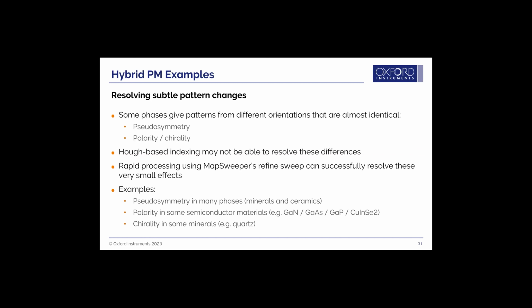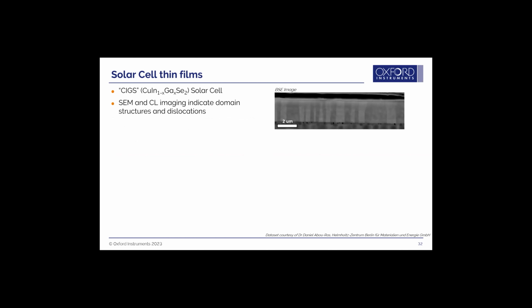And again, we're trying to solve this pretty quickly. We're trying to resolve the pseudosymmetry rather than just flipping the data like we have in the past. Again, the cleanup is a little bit too liberal in the crystal software to begin with.